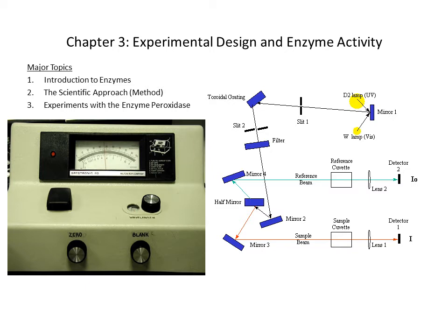Not emission. Okay. And so we're going to measure how much brown light gets absorbed. Or how brown it is, I think, actually. Anyway, so we're going to select the wavelength, and the instrument is variable, so we have to designate which wavelength we're going to measure. And what it will measure is the difference between what it sent to the sample and what made it through the sample.